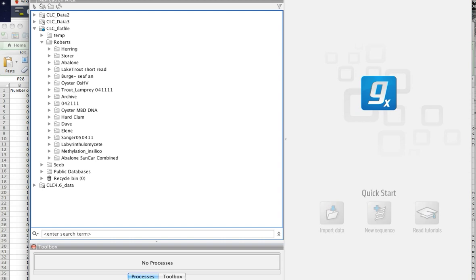Different populations. Do you think that I should do exposed control stuff? Because I kind of have that for Carmel already. I mean, how many pie charts do I want to do? Okay, now we're done with pies. We're done with pies. Yeah, but you could do pie charts for each one.